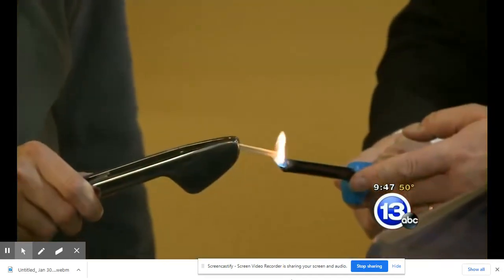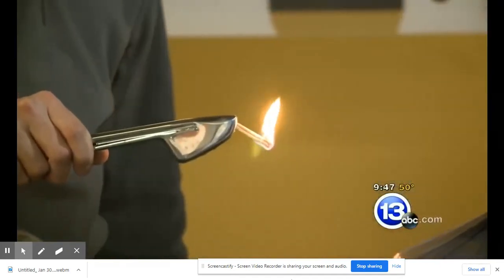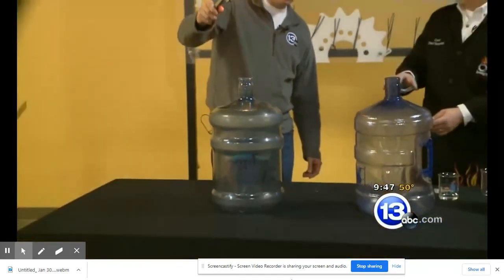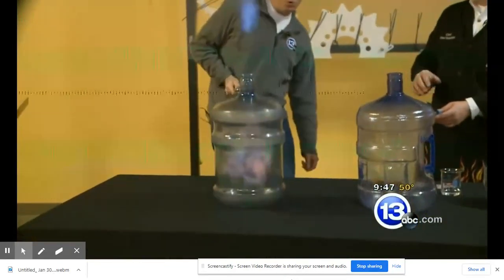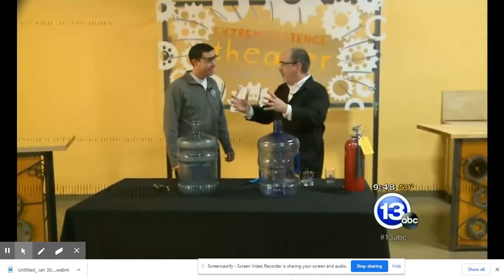Okay, so let's light the matches here. And once you get them lit, give them a second. And then we're going to have you come over the top of the jug and just drop the matches into that flammable mixture of gases. Right, here we go. 3, 2, 1. Woo! It ignited. You get that whoosh of air coming out. That's what we call the whoosh jug.